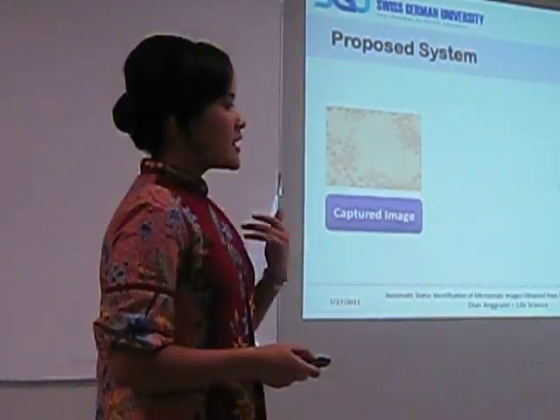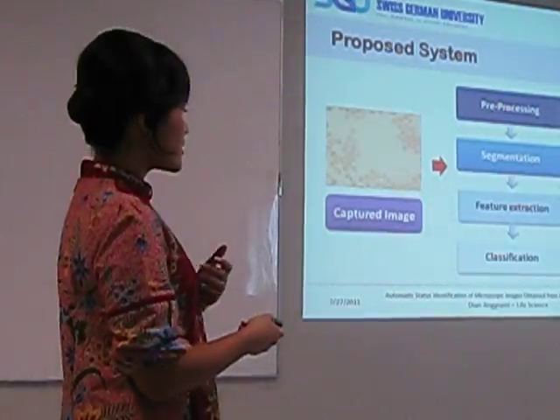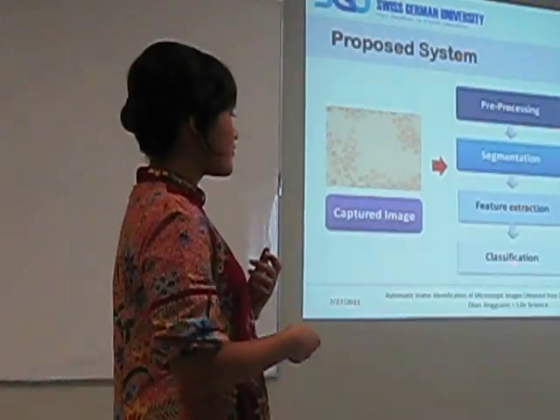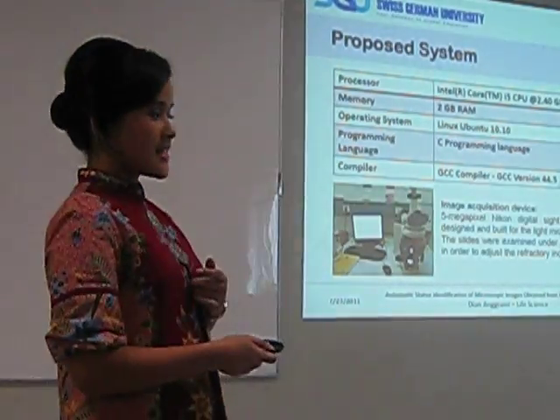We propose a standard image processing scheme that processes the captured image and extracts important and relevant information to further classify each image as negative or positive. This is our testing environment.